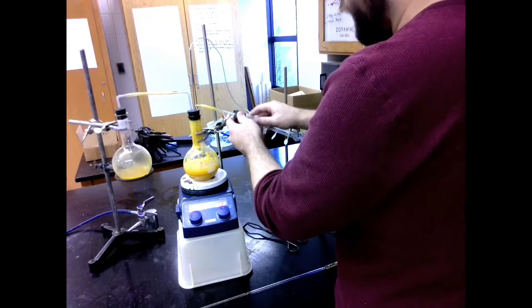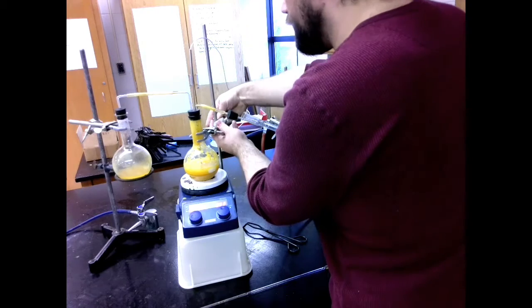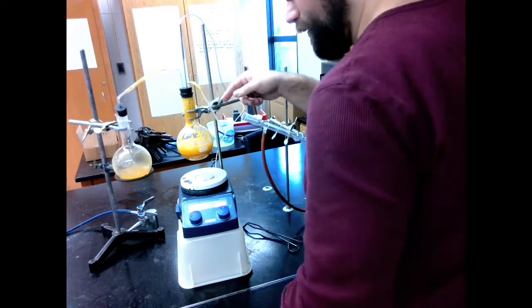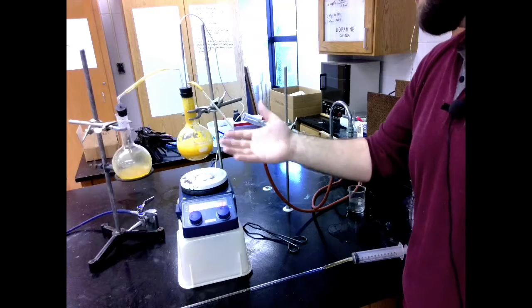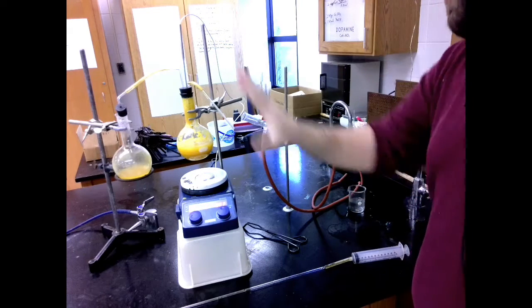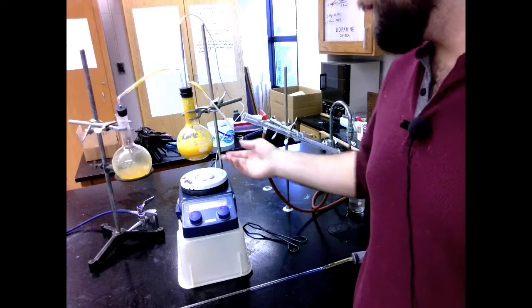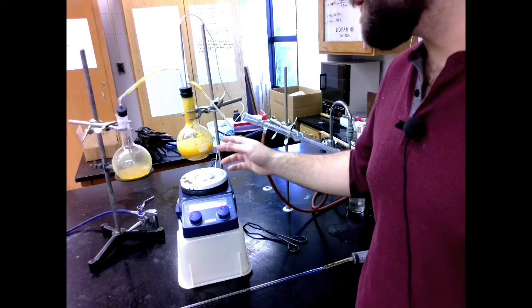Once this part has cooled down, you can remove your corks. And then using this guy right here, you can lift this up off of the hot plate so that this section can air dry or air cool. Once everything has cooled down, clean this whole area up, return everything to its rightful spot. Make sure you clean these slurries out. This can just be dumped outside. All it is is orange zest and water.